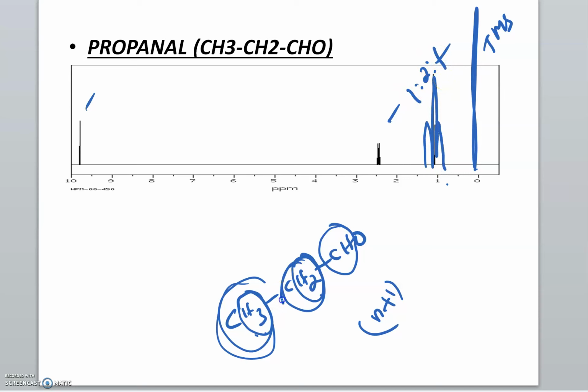And this CH2 is nearby these 3 hydrogens and 1 hydrogen here. First, these 3 hydrogens split the line of CH2, that is at about 2.4 delta, into a quartet. And each line of the quartet is again split into a doublet by this hydrogen. Therefore we get a multiplet. Like that, a total of 8 lines will be here. Okay, that is the case for the CH2 group.